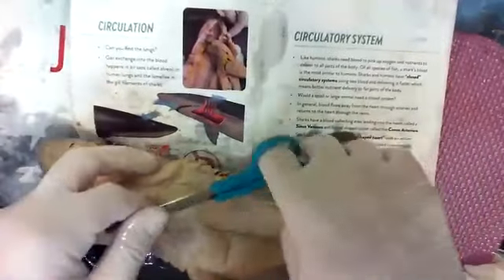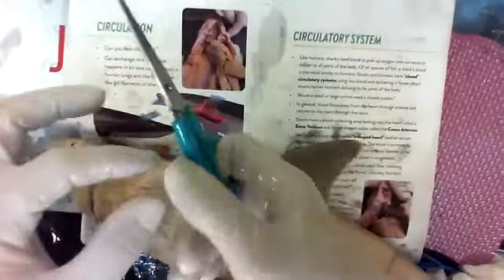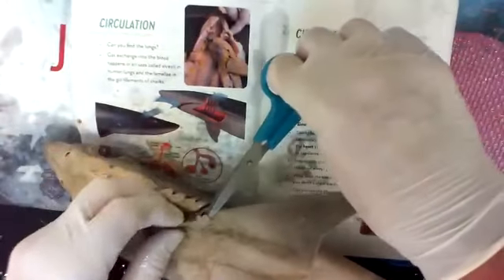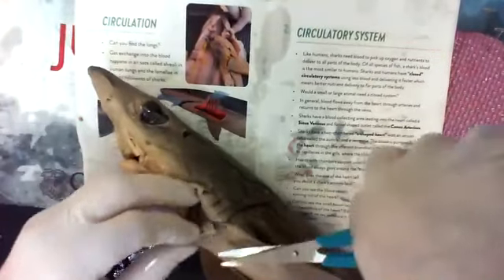The skin is a wrapper, but the muscles have wrappers around them too. So if you're eating chicken that's been cooked, you can peel the muscle groups off and the muscles stay together because that wrapper kept them intact like a hot dog or a sausage just stuck together. We're gonna go in and try and peel a little skin off real quick. We got a couple minutes. So I'm gonna find, there you go.